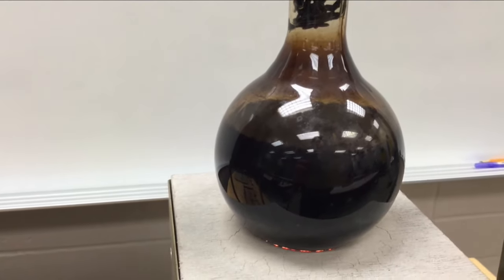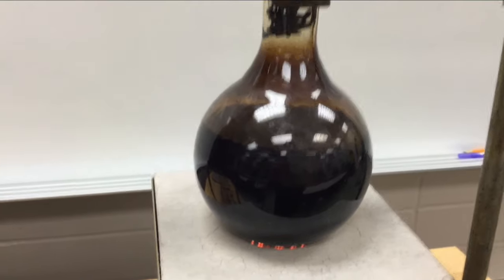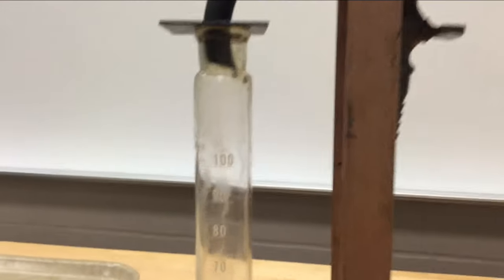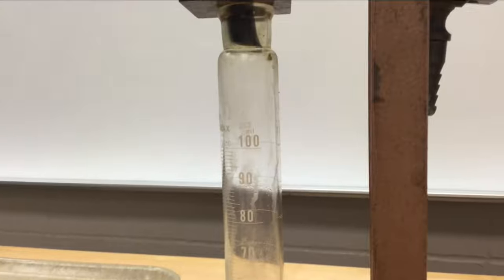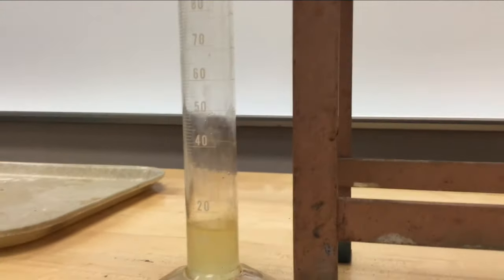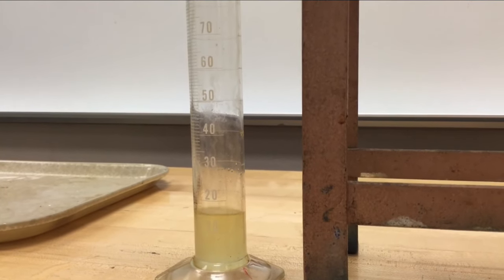So if I come over here now and take a look at how much is coming out of my condenser. So you can see the dripping coming in. Drip, drip, drip, drip. Hey, look at that. We're already over 10 milliliters. We're actually about at 15 milliliters right now.